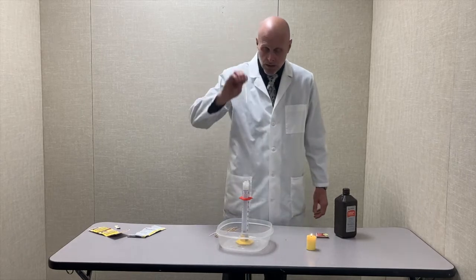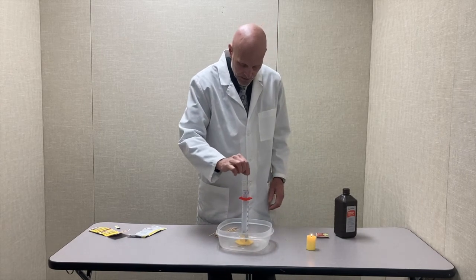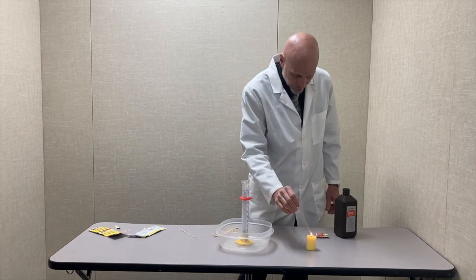Now I'm going to use one of these wooden splints to pop some of those bubbles and that will release the gas that's in there. I'm going to take a dry splint and light it on fire.